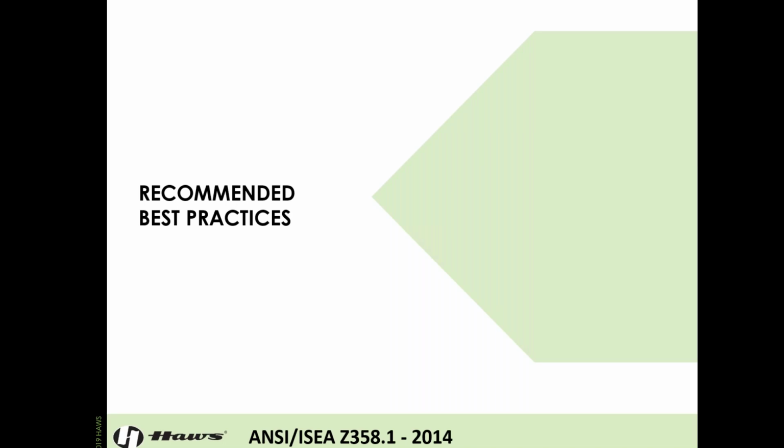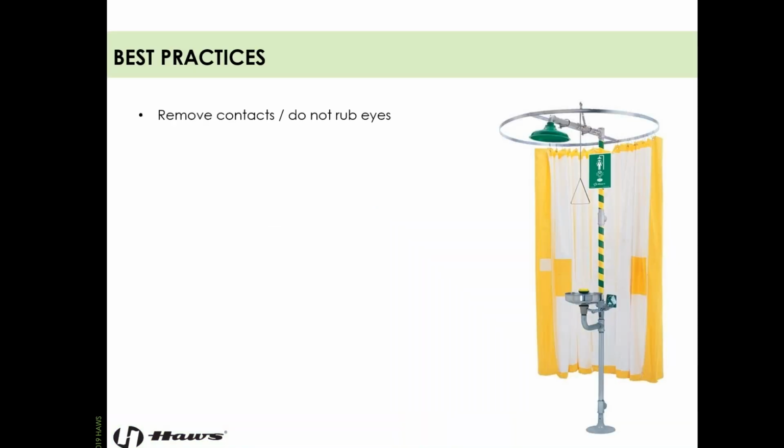Okay, so a couple best practices real quick. Number one, remove your contacts. That should totally make sense to everybody. Don't rub your eyes. Don't try to unintentionally spread that contagion. And contaminants can get trapped between your contacts and your eyes, so pop those out right away.